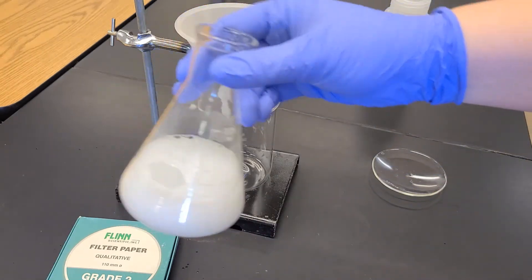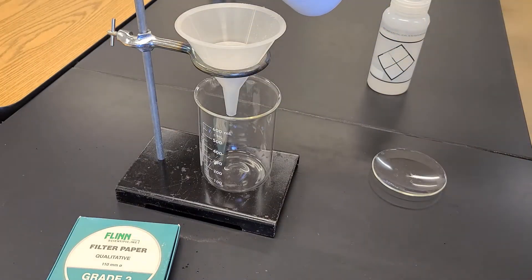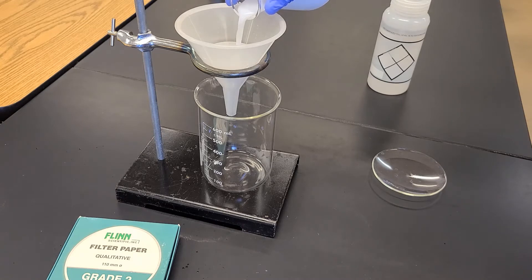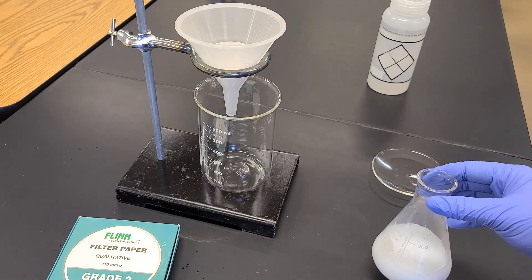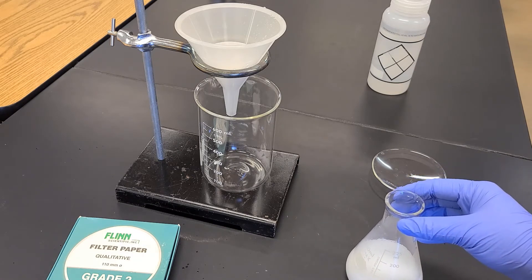Now I'm going to take our mixture here, our solution with the precipitate, and I want to filter that through the filter paper.